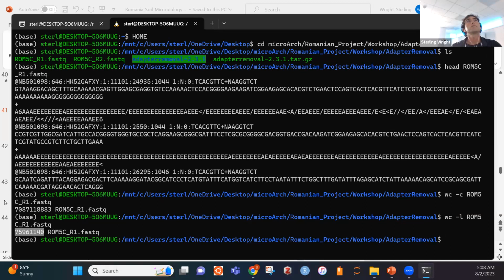All right. Is that good for the FASTQ file for you? Yeah, I actually have another question. What's the length of the reads? Because it seems to be a standard length, isn't it? They seem to be all the same length, at least the first couple of them. Yeah, so we can actually check that.